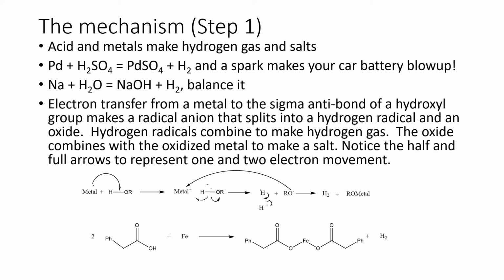In the same way, in our reaction for this experiment, iron will react with the acid. In a similar way, it traps the hydrogen atom, then the acetate radical will be formed, and two of the acetate radicals will stabilize by sharing their electron with iron, and as a result, hydrogen gas will be produced.